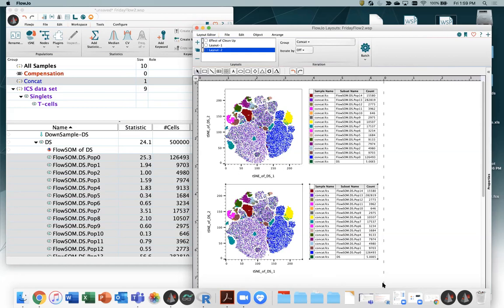And the other thing to do is, if I didn't know, then I would look through. And if I did have a population that was something under 50 cells, I would be extremely dubious about it. You'd want to look at it. I'd also maybe choose some clustering algorithms like Phenograph that are particularly good at clustering for rare events. It's going to attempt to highlight things that are very, very tight. It may be only 50 events, but they're all really, really similar. It gets a cluster. If they're not really, really similar, they don't get a cluster. And so you will tend not to get clusters based on tiny, small populations that aren't real. So something like using Phenograph will just help.